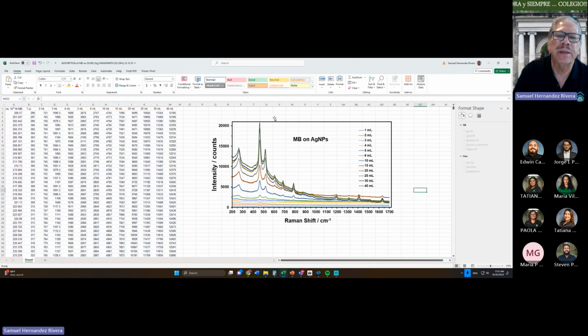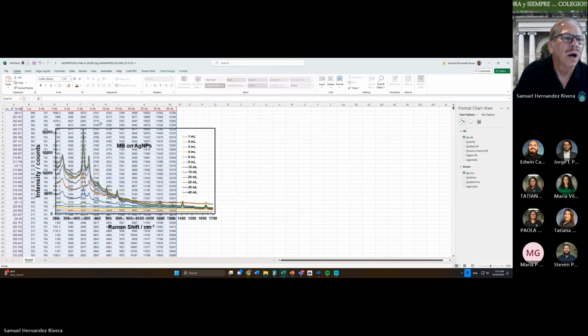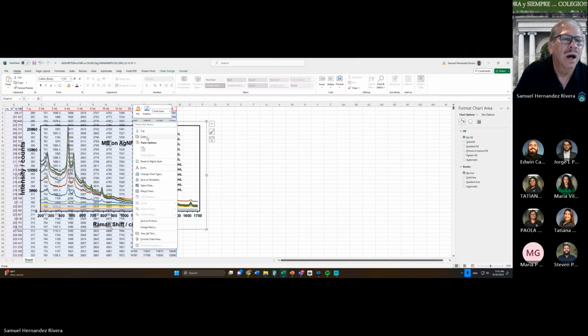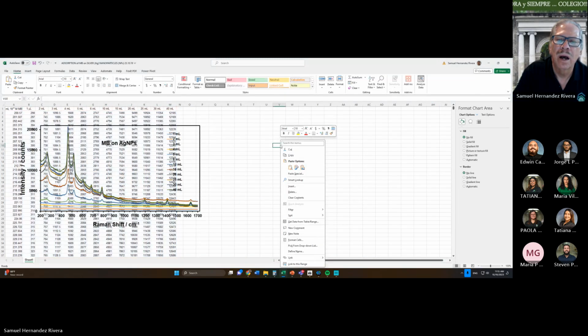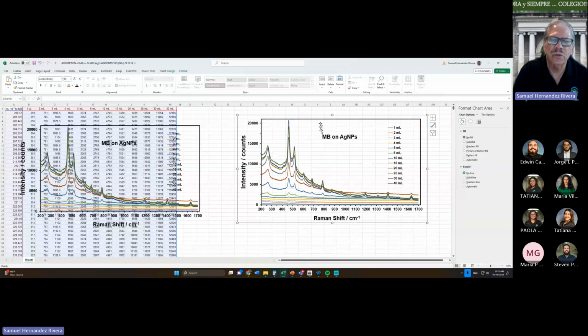Let me copy that. I'll show you what we're gonna do. Okay? Now we're going to select this band, these two bands only.